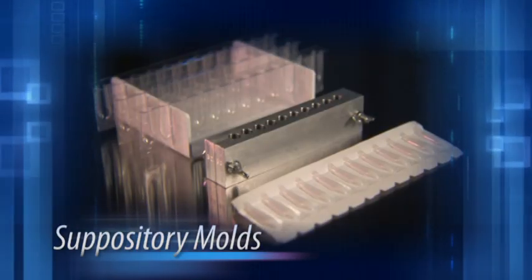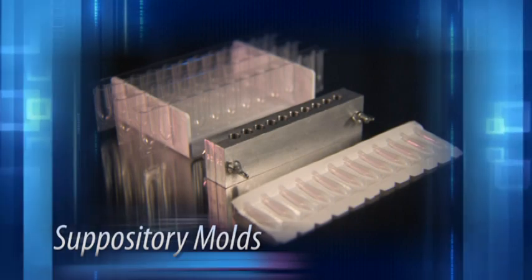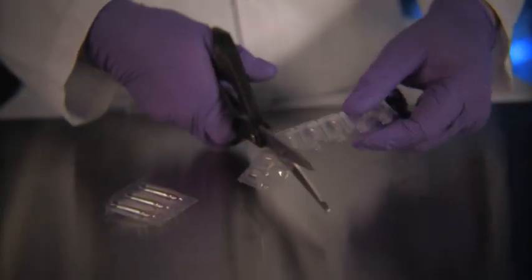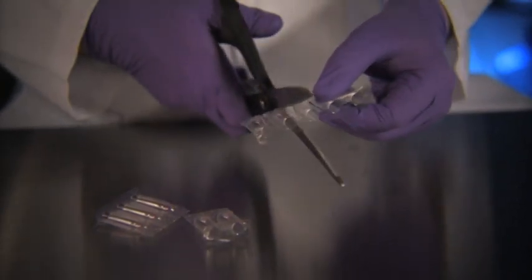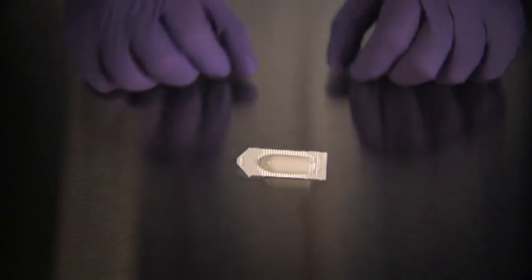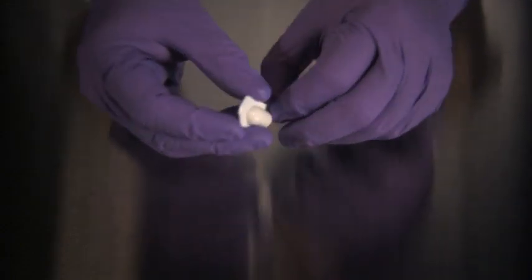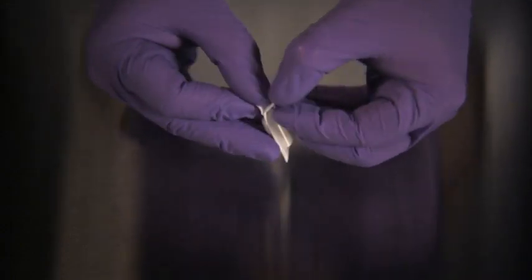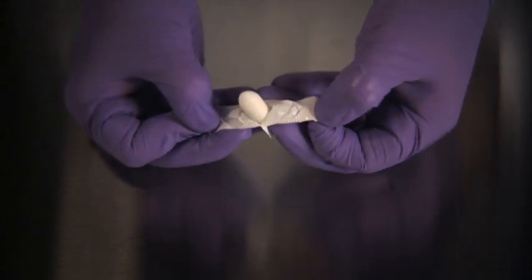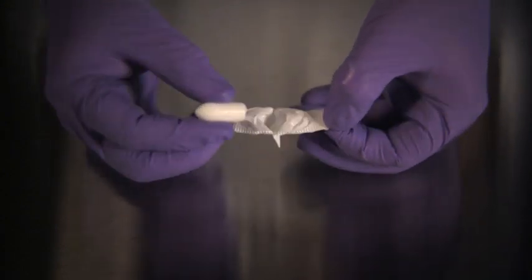Suppository molds are made of plastic, aluminum, or rubber and are used to shape a compounded suppository. Plastic suppository molds come in long strips and can be cut into any number of smaller molds. Once the suppository hardens inside, the open end of the shell is sealed. When the patient is ready to use the suppository, the shell is peeled off and discarded.